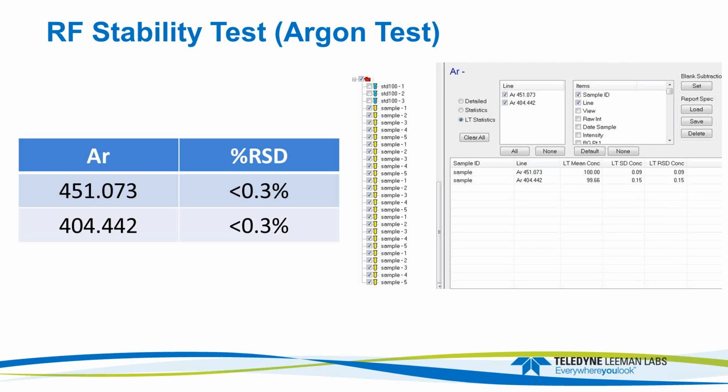Again, like the mercury test, if I'm dealing with something that's intermittent, then I can extend this test for a longer period of time. This is a 20-second integration time, but I can use shorter integration times. I can do the same on the mercury test. So there's a number of different ways you can apply the test depending on the situation. Anything that's intermittent, we want to go for a longer test and maybe shorter integration time to try and catch whatever the perturbation happening is.